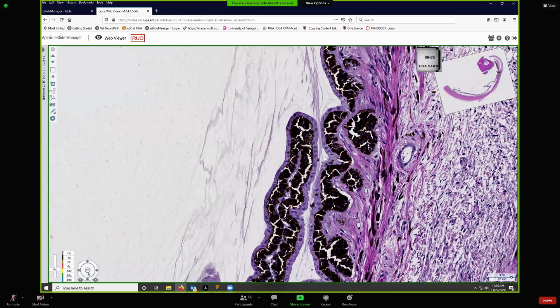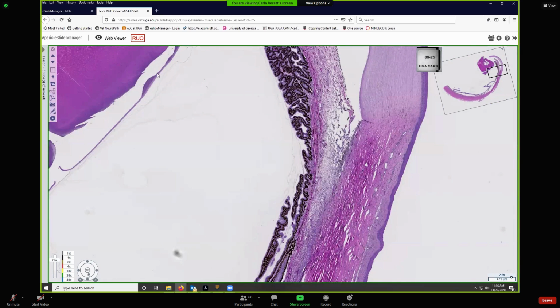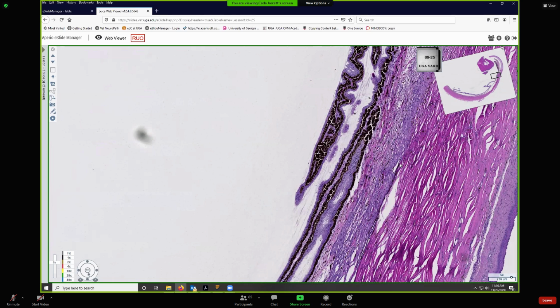So those zonular fibers are attached to that basement membrane right there, and they span over to the lens. If there's tension on these zonular fibers going over to that lens capsule, from basement membrane to basement membrane, lens capsule to the basement membrane of the ciliary epithelium, then if that ciliary smooth muscle is flat, we're keeping that tension. But if this ciliary smooth muscle contracts, shortens, it will mound up this region right here.